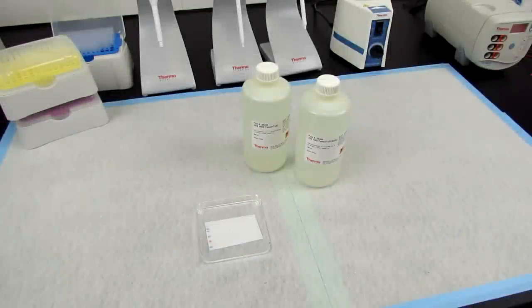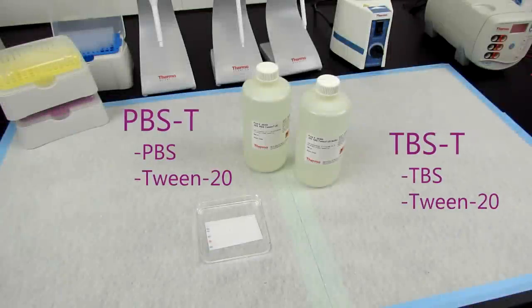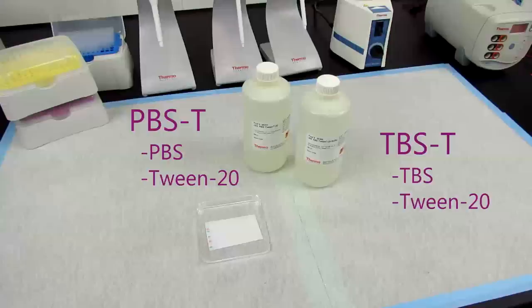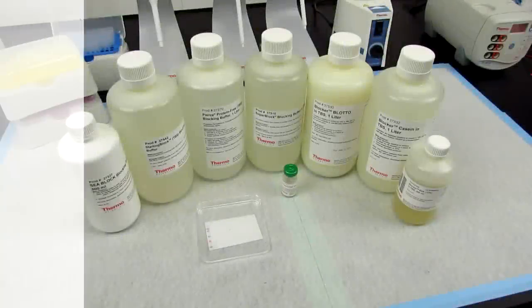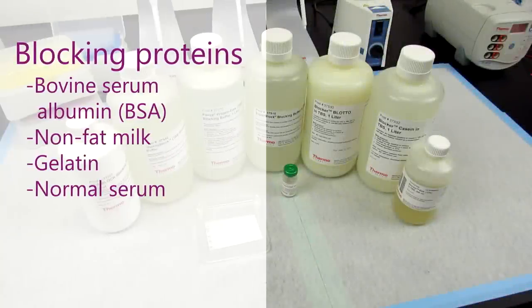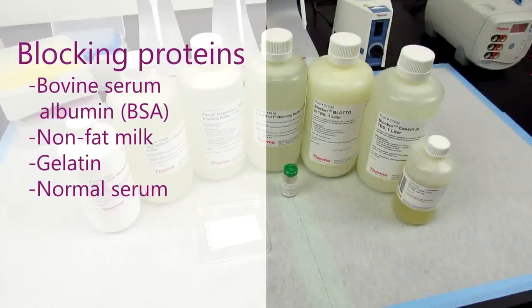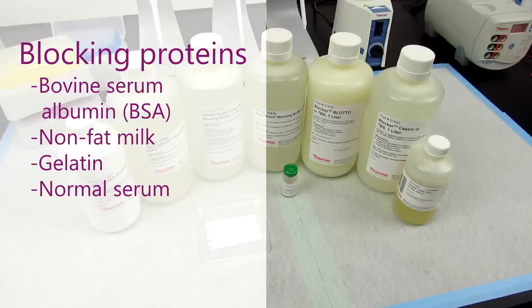The membrane is blocked with a buffer that is often comprised of tris or phosphate-buffered saline with tween-20 detergent and up to 5% of a non-reactive protein, such as bovine serum albumin, non-fat milk, gelatin, or normal serum.